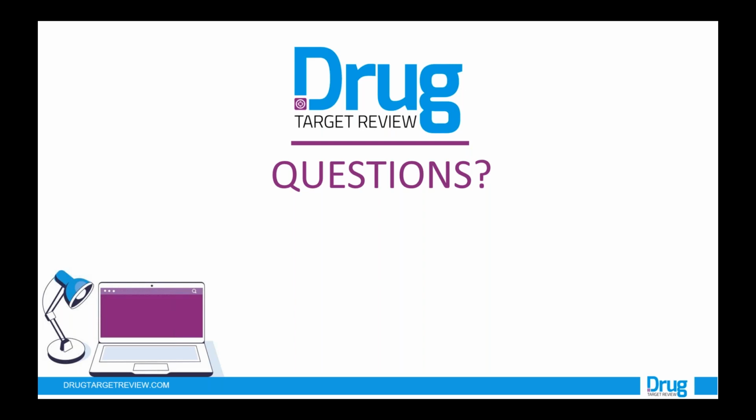Okay, so next question now for Paul. In your one-pot format, do you worry the hybrid lytic detergent would resolubilize aggregated proteins? Well, just a point of clarification. We're not using that platform technology. This is the InCELL Pulse technology using the Eurofins DiscoverX EFC technology. But we do have a detergent. After incubating with compound and performing the thermal pulse, we do lyse the cells and add the detection reagent so it has access to the intracellular targets.